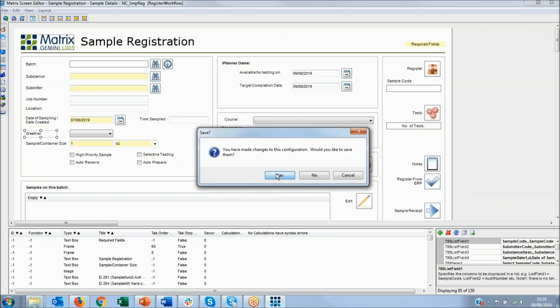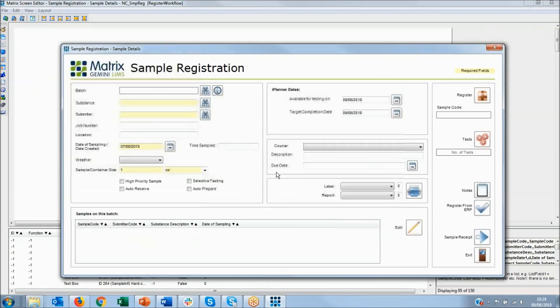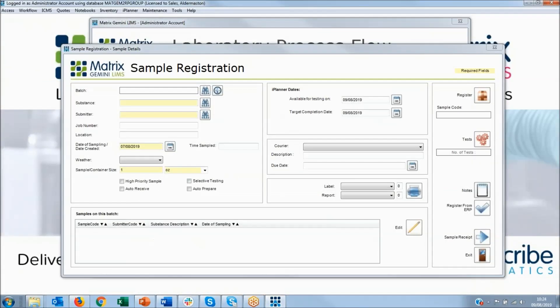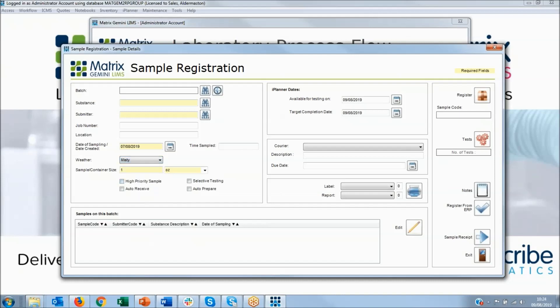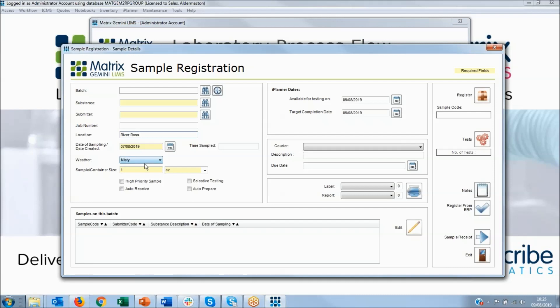We'll save that, and immediately you can see those changes available. And here's the list which I've predefined. So we could call that misty as we're taking the samples. So we know it's been taken at the River Ross and we know it's misty.